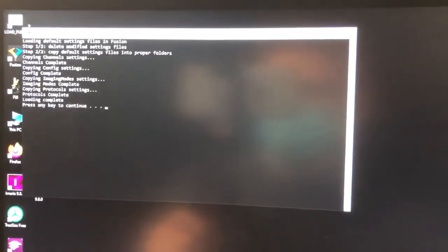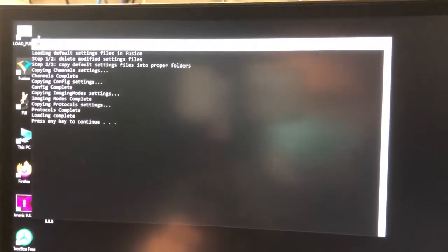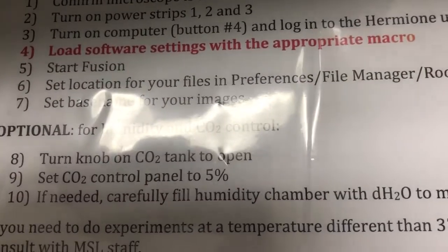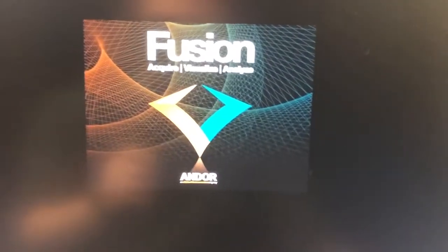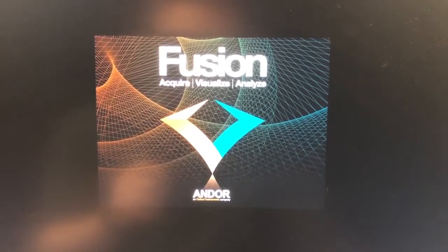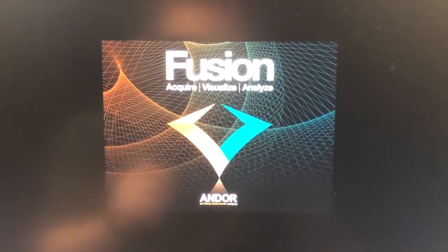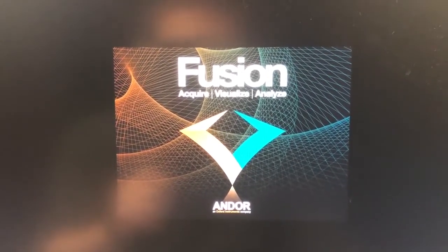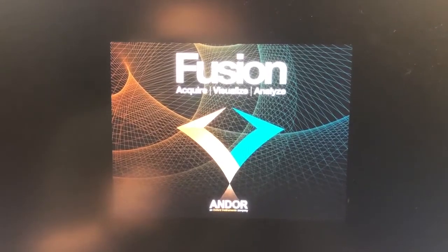When that happens, a bunch of stuff will be copied, and then it says 'press any key to continue.' At that point we are ready for the next step, which is step 5: to start Fusion. The Fusion icon is at the top left-hand corner of the screen — you can double-click it and Fusion will start. When Fusion starts, it can take a few minutes to load up and communicate with all components, and as it does so you will get multiple error messages. This is perfectly normal.